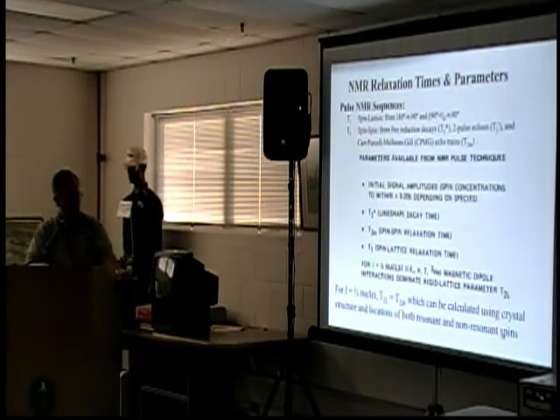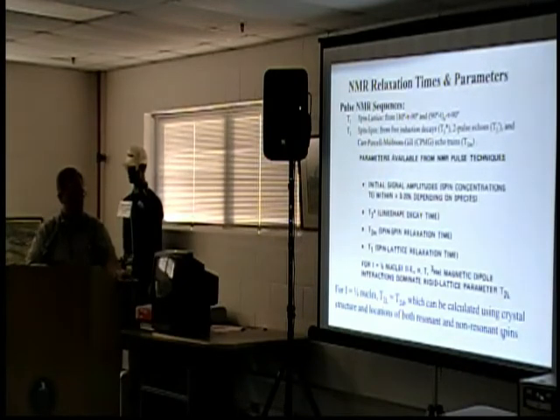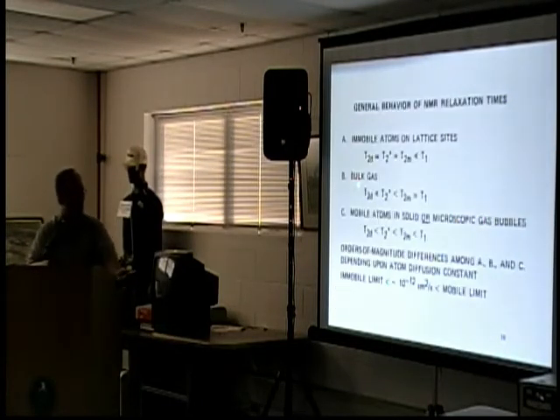Now for the spin 1/2, things like hydrogen or tritium or helium-3, the magnetic dipole interactions dominate that. Particularly if the spins are sitting in a lattice in a position, the geometry determines what the T2 is, called a rigid lattice, and you can calculate that from first principles from geometry and compare that to what you measure, so you know what the spins are. And you can actually analyze that in many cases to get more information on the geometry, the locations of the spins. But if you go to the next slide, we talk about that in general.